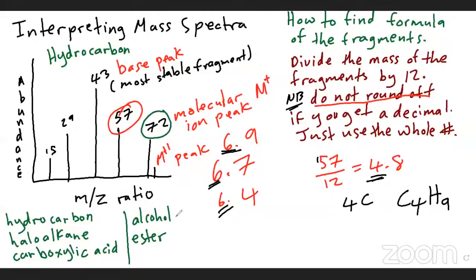Some comments. So for the molecular ion, would we round off? No. I don't use that formula from the textbook.